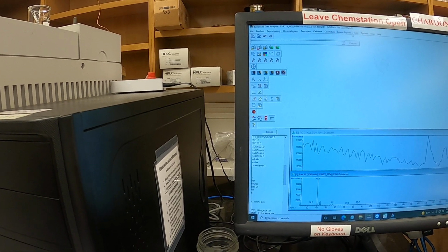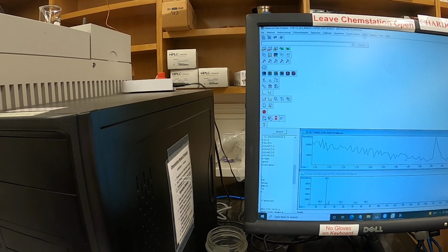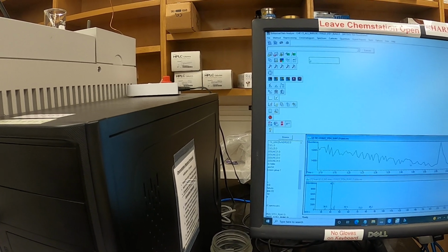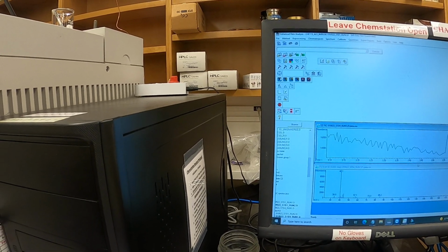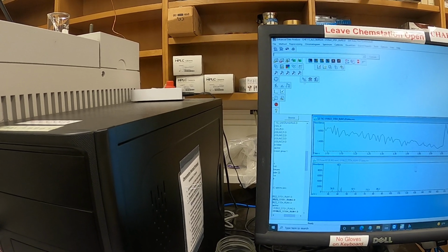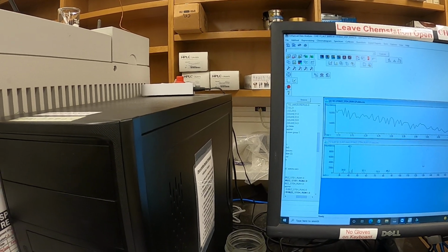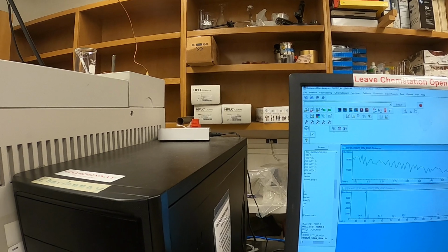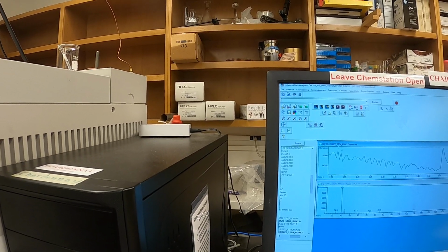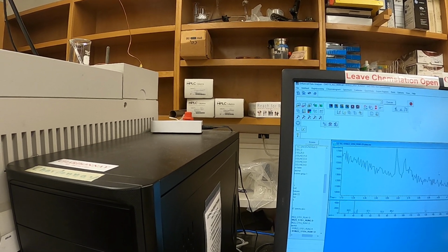Oh God, I hate that. Can I reset the windows? Does that work? Jeez. This is like my true pet peeve. Did you guys see me do anything? If you saw me do anything that made this happen, let me know. Oh, this is weird. All right, well, at least we got bigger windows now. Let's try another snapshot. Still nothing.